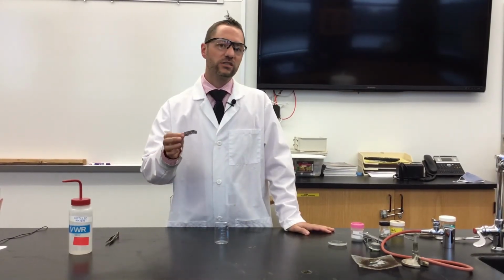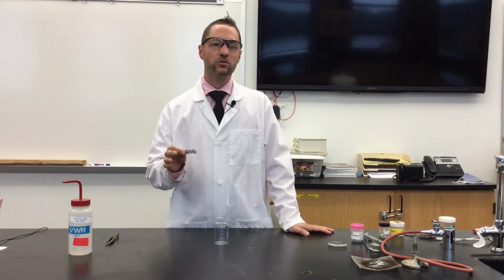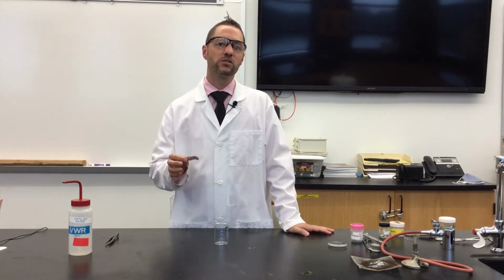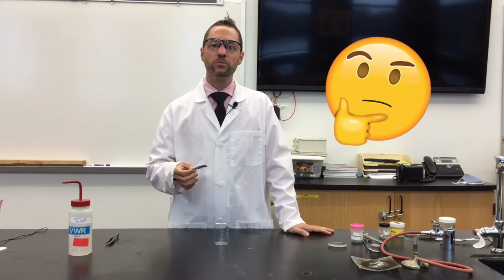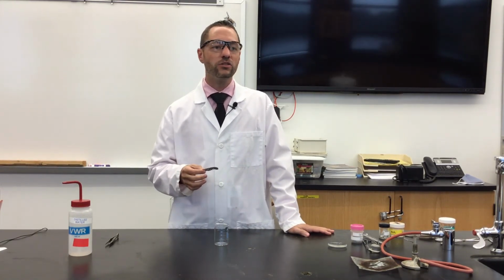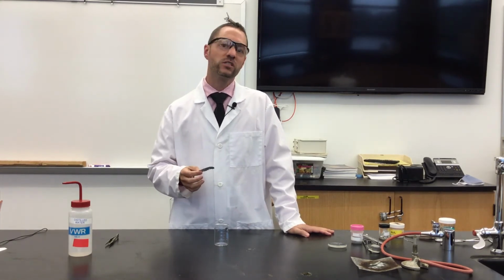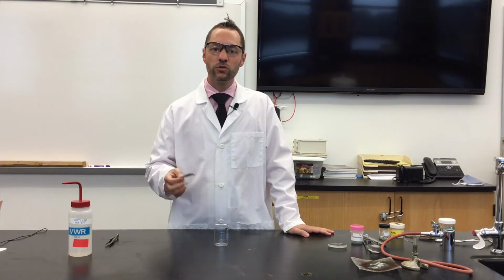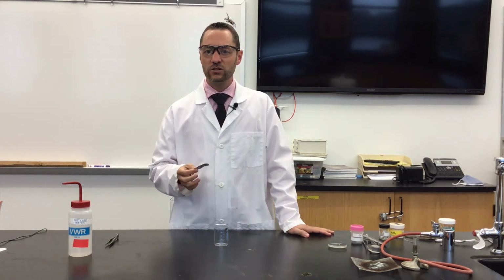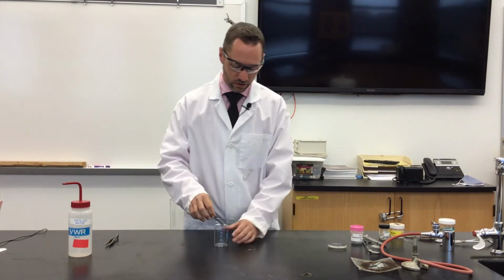Now we're going to test the reactivity of the aluminum with water. But before we do, I want you to use a little bit of common sense. After a meal, you wrap up your leftovers with some aluminum foil. You go to the store, you're thirsty, you buy a can of Pepsi soda that's in an aluminum can. So think to yourself, how reactive would aluminum really be with water?